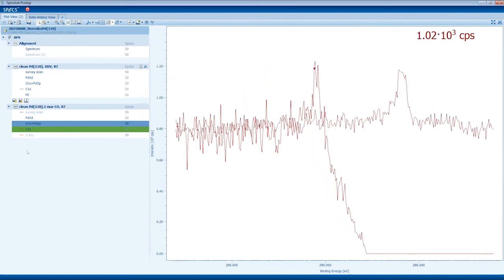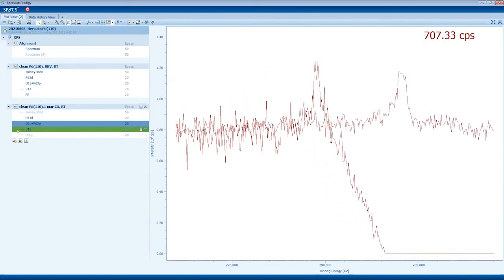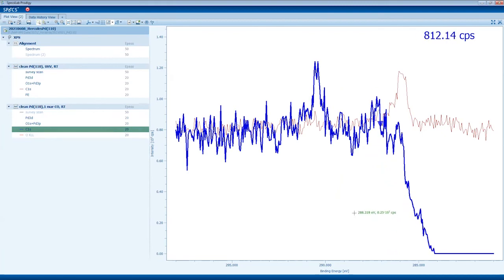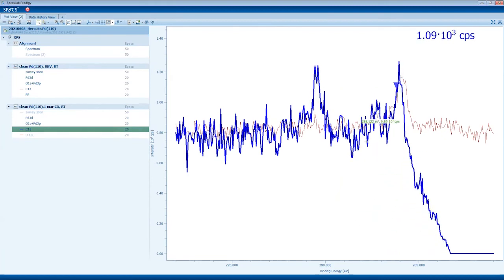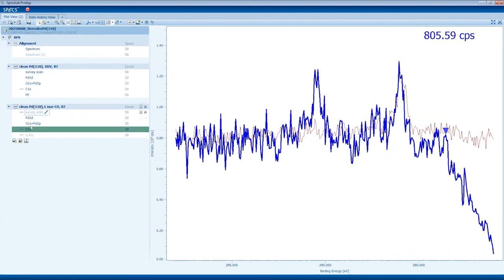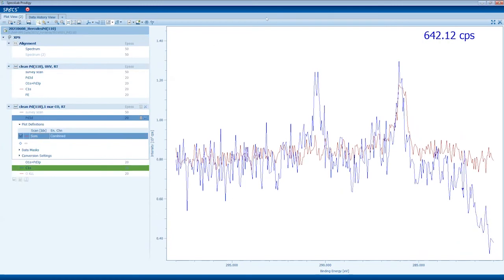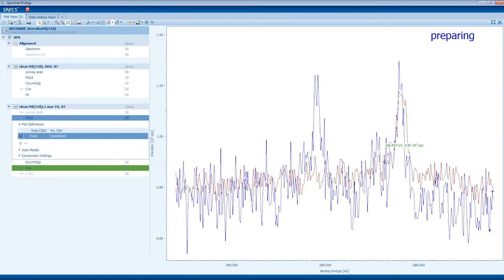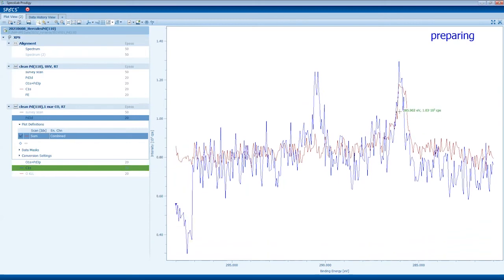Let's see. So here it is. We change the color. This is the gas phase. Now, 286 will be the, I mean, a big change, but I think it's here something. So this is some adsorbed, maybe. This is maybe some carbonyls.